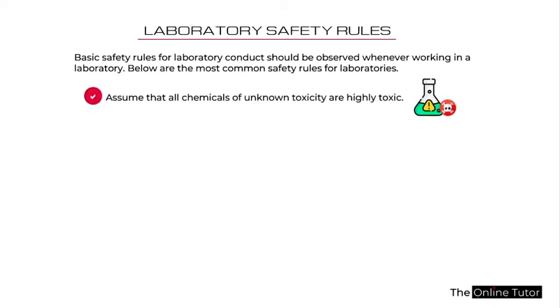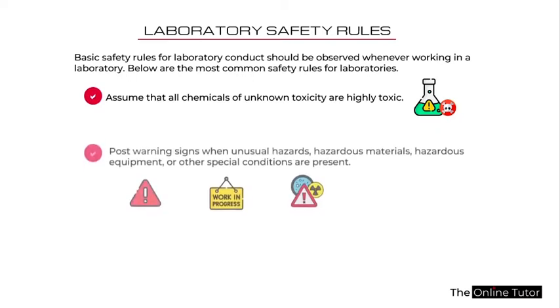You have to assume that all chemicals of unknown toxicity are highly toxic. So don't assume that any colorless liquid you see in a beaker in the laboratory is water. Assume that they are highly toxic and you don't play with them. In that way, you are safe, and there's no way you're going to use any chemical whose toxicity you don't know to play with. So don't assume anything is less toxic. Assume that every chemical in the laboratory is highly toxic and then proceed with caution.